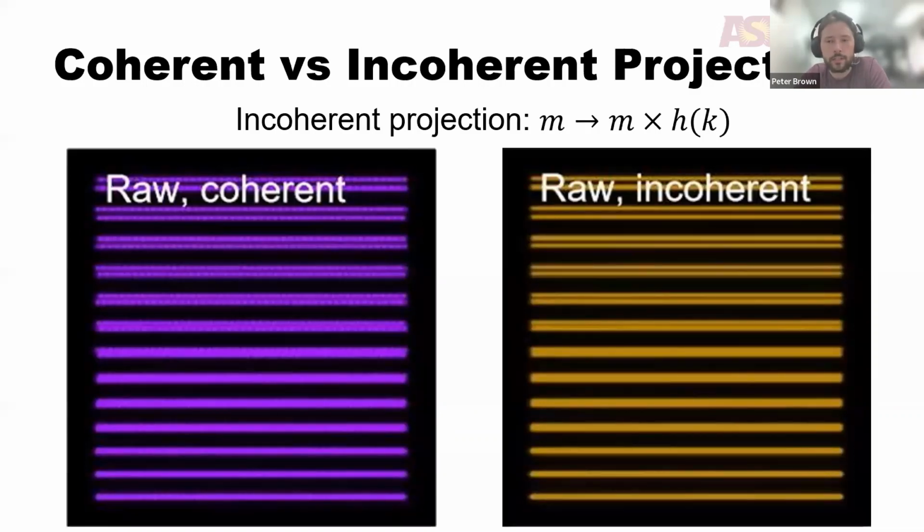Another important effect that can limit your modulation is the coherence of the light that you project onto your sample. So in particular, if we have coherent light, it will diffract off whatever modulator we're using to generate our patterns, be it a diffraction grating, DMD, a spatial light modulator. And then this light will travel through the system according to the coherent transfer function. And so in an ideal case, it will be unattenuated. The beams will interfere and we'll have modulation contrast of 1.